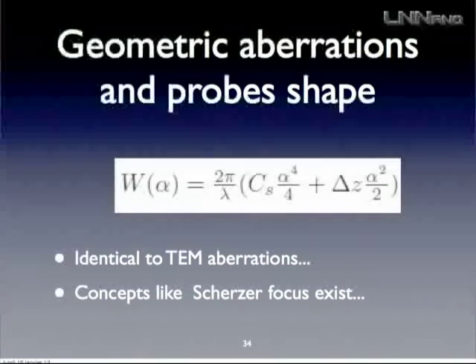And it's absolutely not the topic of my talk to discuss that, but you can do a lot of image simulation for STEM like you have to do with TEM. It was not as easy to do maybe 10 years ago because it's a pixel per pixel imaging process where you in fact have to have an image of all the diffraction pattern at each position. It's very time consuming for a computer, but now it can be done. There is free software for that.